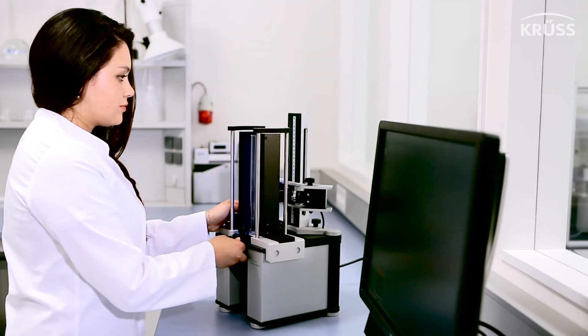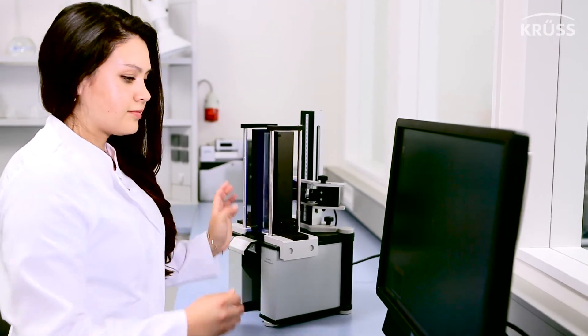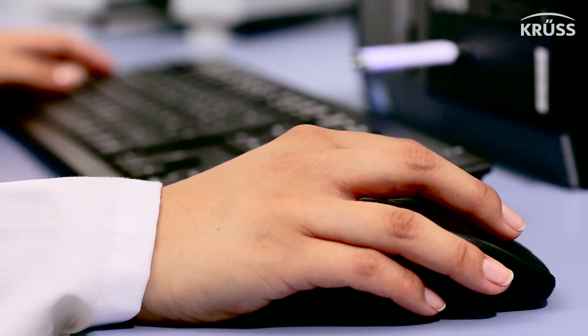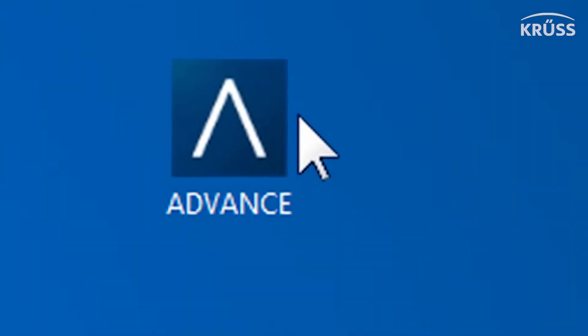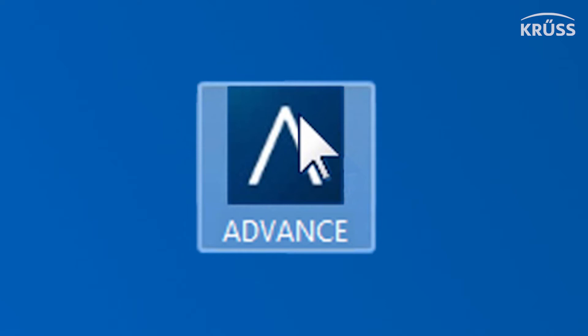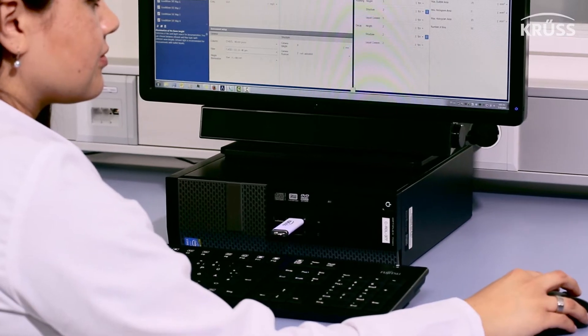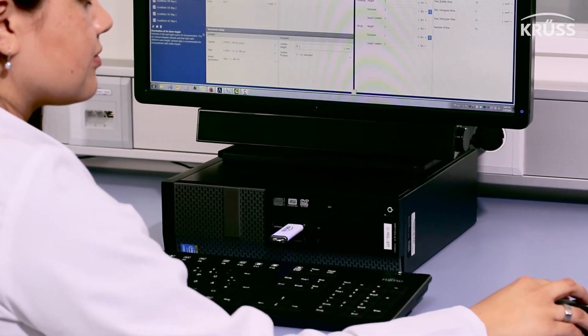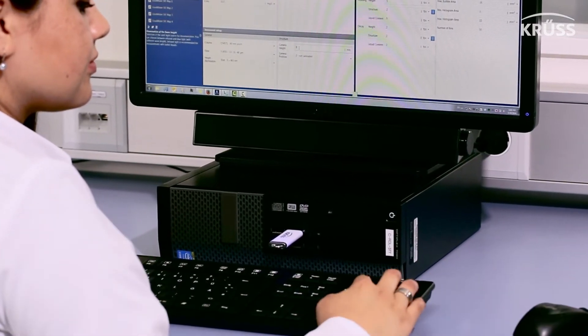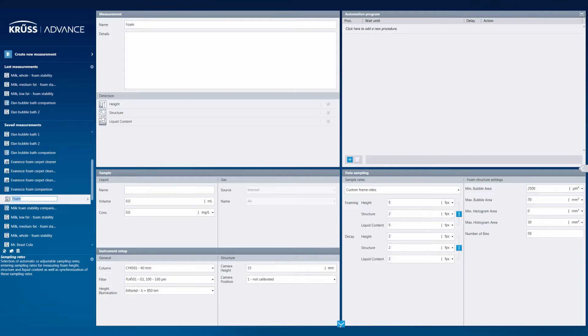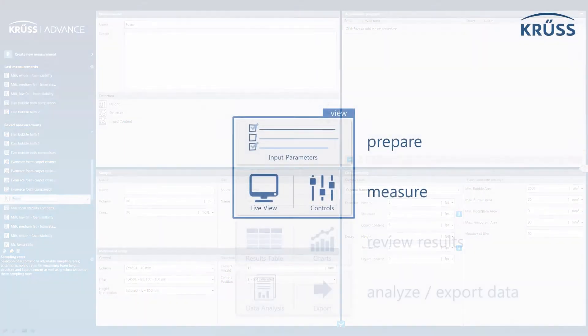The high level of thorough precision and polished user experience make ADVANCE, our software, the very best to analyze the complexity of foam. In ADVANCE, a new measurement follows the four steps of a standard scientific workflow.